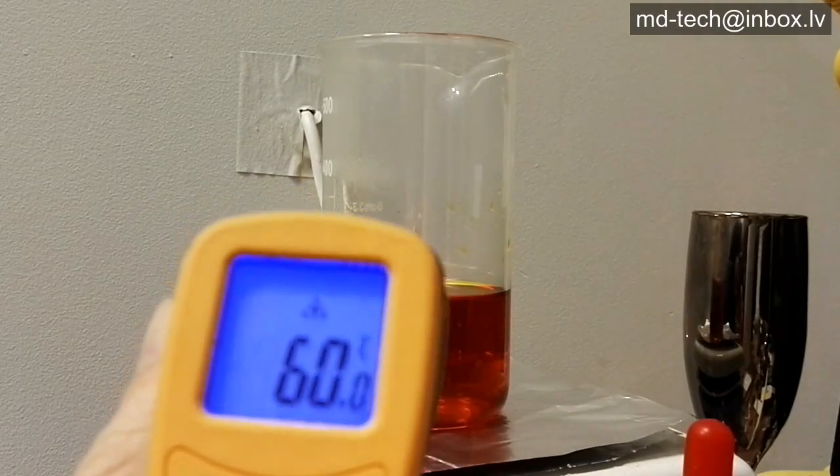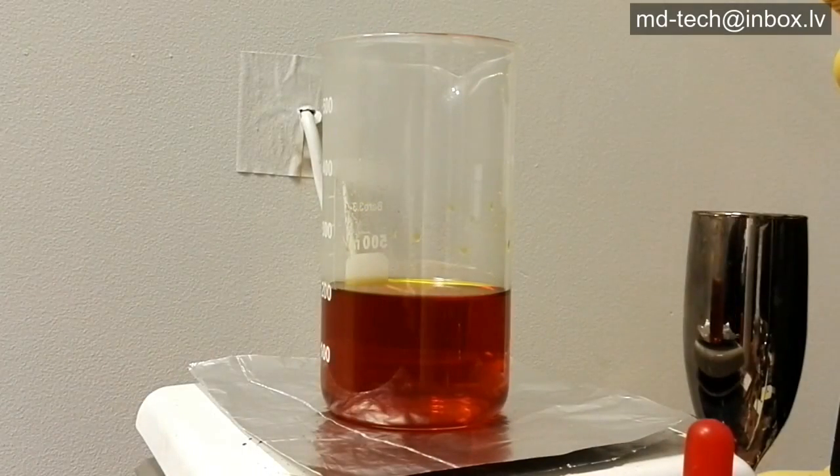After the solution is heated up, I use sodium bisulfite to precipitate gold. Palladium and platinum remain in solution.